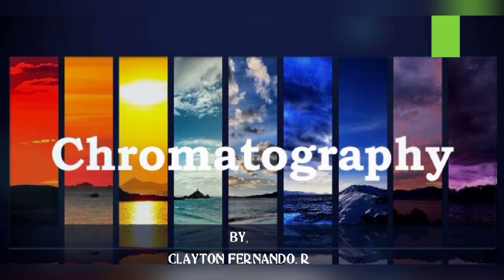In today's section, we are going to see a brief review about chromatography and its types, and then how chromatography can be used for the separation of compounds in research and industrial purposes. We are going to see, first of all, what is chromatography.